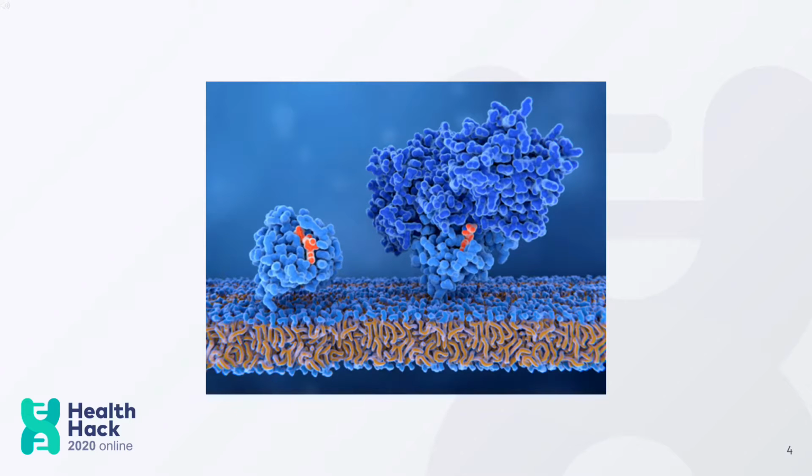Recent advances in the field of single-particle cryo-electron microscopy have allowed researchers to solve the structure of membrane proteins by capturing images of individual molecules at near-atomic resolution. However, solving the structure of a membrane protein with this method is still a monumental task, and the analysis workflow suffers from significant bottlenecks that result in these projects spanning years.